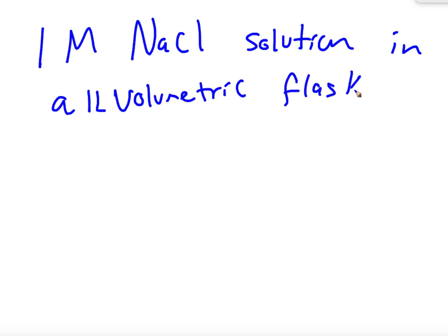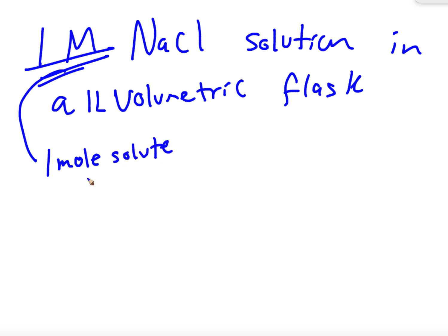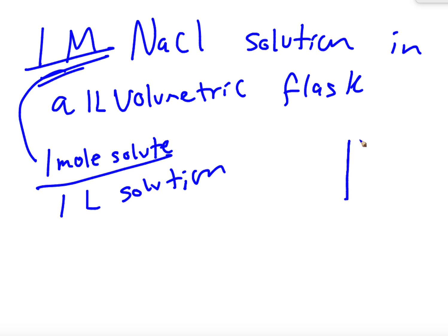So, first thing, we look here, 1 molar, right? And 1 molar means 1 mole of solute per 1 liter of solution. So keep that in mind. Very, very important. Okay, so now, obviously not drawing to scale. Now we'll fill my water up to here. Water's already in here.